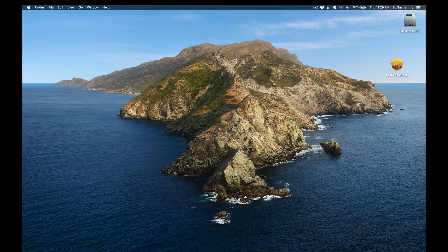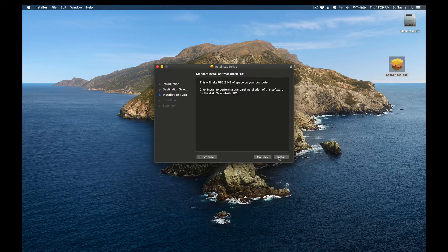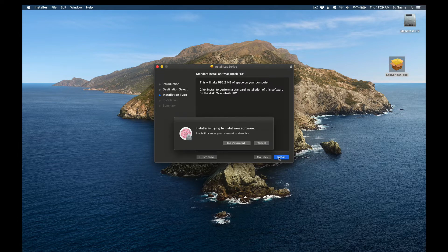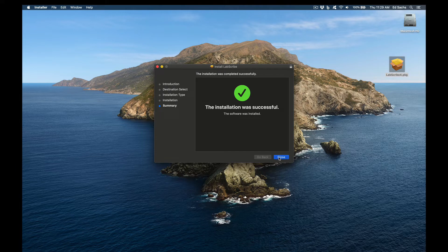With the installer now on your desktop, double-click it, press Continue, now press Install. Put in your password for your Mac, it'll go through the installation process, and then click Close.